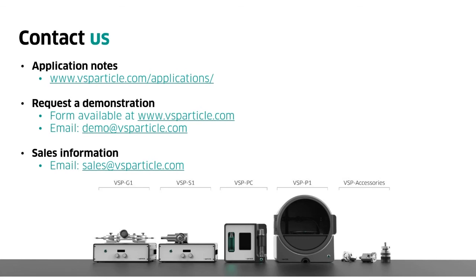Somebody is asking us, do I need to use a neutralizer to charge the particles produced by the G1? Basically what I just said, it's not necessary. There might be an advantage in terms of reproducibility. We've never really studied that. My gut feeling, basically in my experience, is that you get very consistent results similar to a neutralizer. So unless you are trying to have a completely validated process out of the box, I think you're always going to be better off without the neutralizer. Controlling your gas composition is more important, even with the neutralizer.